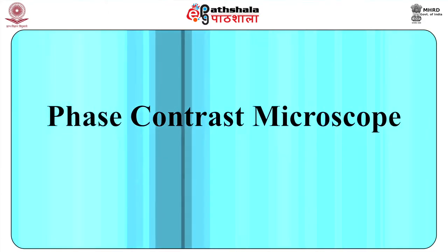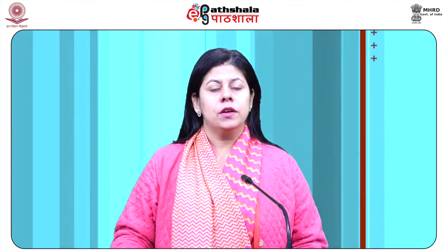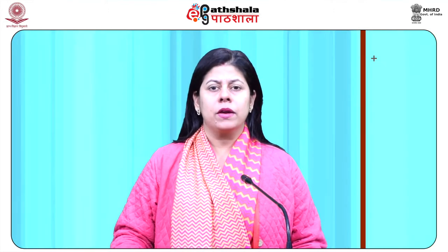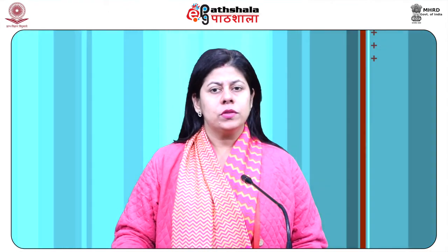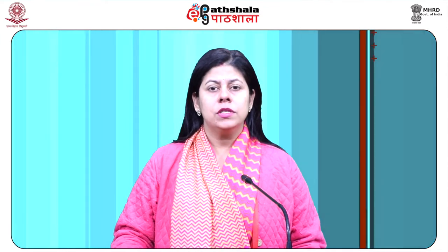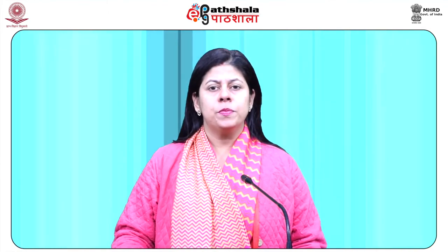Phase contrast microscope. Phase contrast microscopy is an optical microscopy illumination technique in which small phase shifts in the light passing through a transparent specimen are converted into amplitude or contrast changes in the image. A phase contrast microscope does not require staining to view the slide. This type of microscope made it possible to study the cell cycle. The phase contrast microscope is widely used for examining such specimens as biological tissues. It is a type of light microscopy that enhances contrast of transparent and colorless objects by influencing the optical path of light.